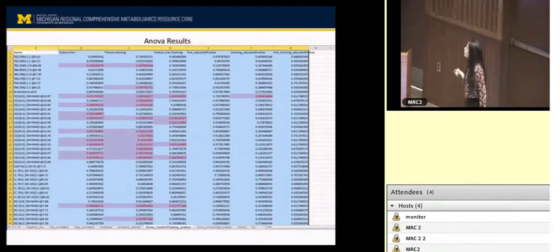And for each of the experiments here, like I said, discussed before, we do ANOVA analysis. The first analysis that we did was on two factors. One was the line, described as whether they are LCR or HCR, and then the training, whether they were trained or whether they were controlled. So we did this ANOVA, and we give the p-values for individual factors, and then the FDR corrected p-values for each of these lipids.